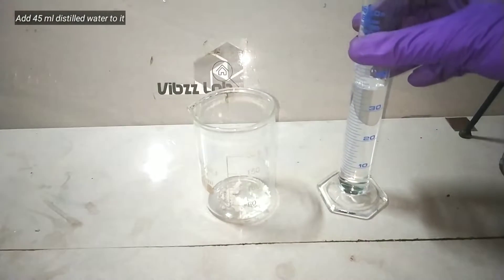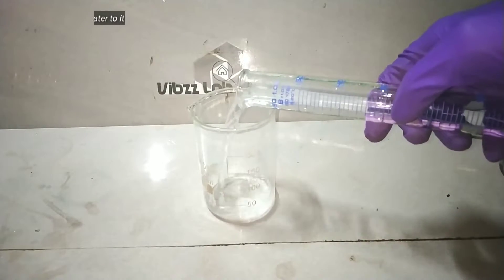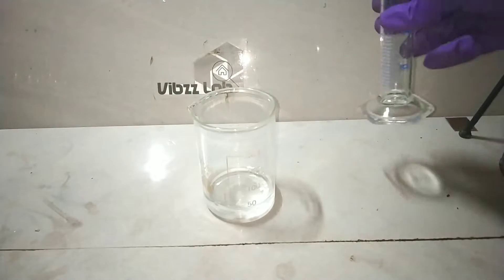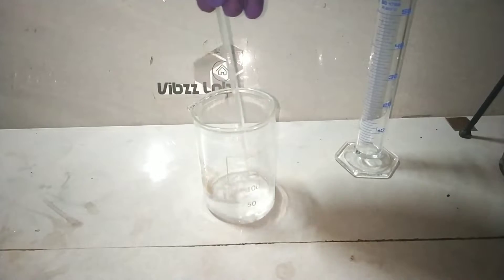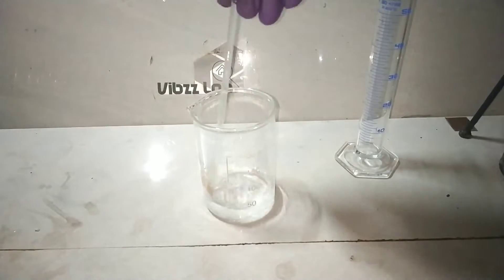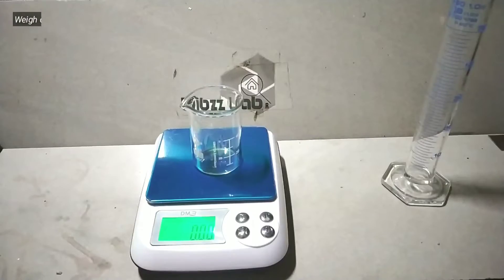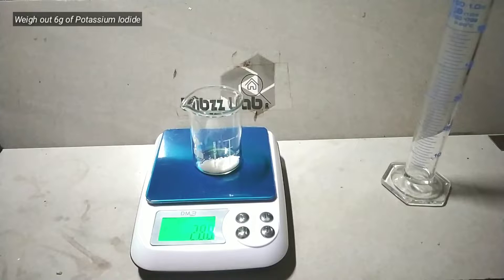Now I add 45 milliliters of distilled water to the mercury(II) chloride for complete dissolution, using a glass stirring rod. Now we weigh out the potassium iodide — 6 grams of it.